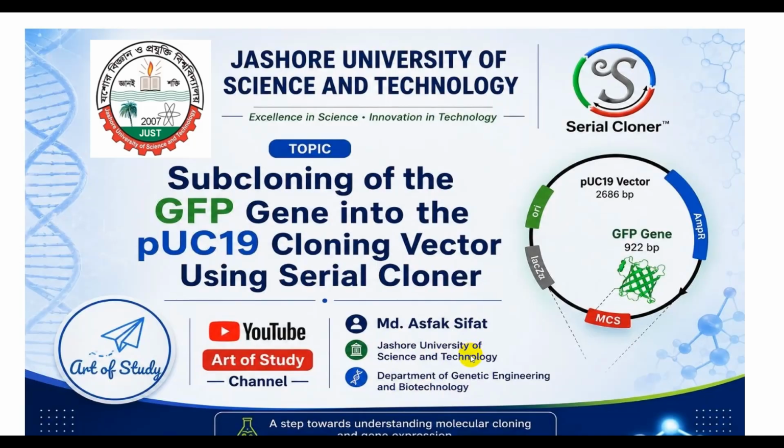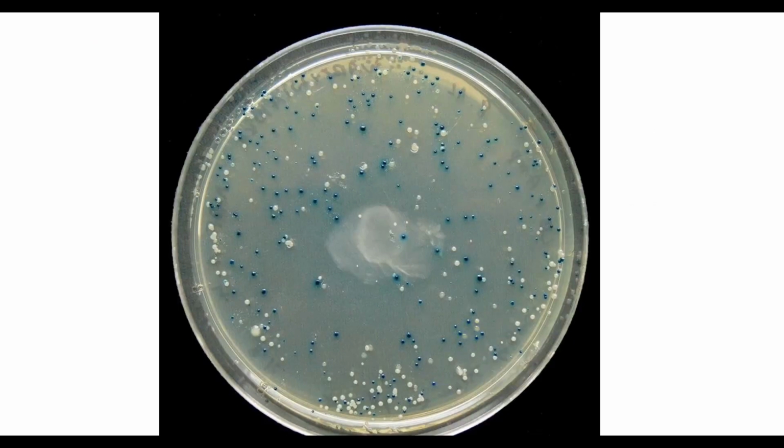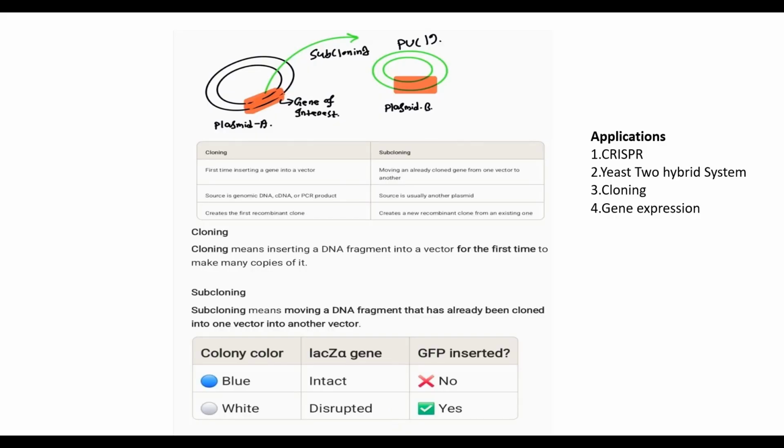Before starting this session, we will first learn something about subcloning, some basics about this. I think you may know about subcloning.